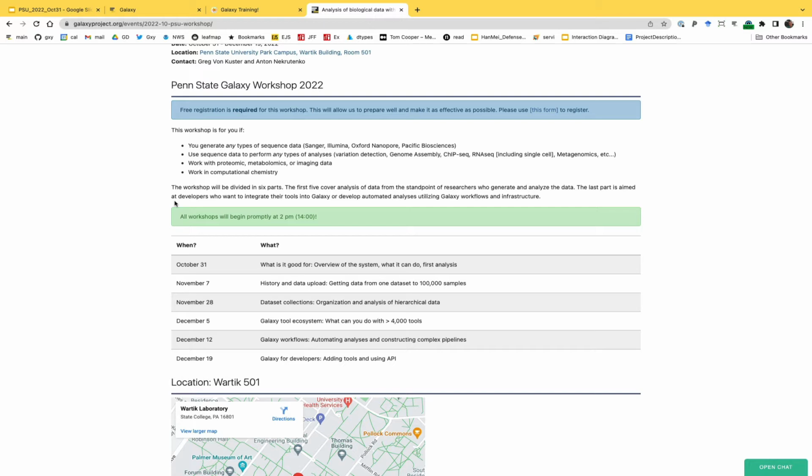So, for example, you're some small country or large country that wants to establish a monkeypox monitoring system, and you collect data, and you just need to analyze it, say, on a daily basis, 100,000 samples today, and so on. So you can just automatically submit these samples and get your results. That's what we're going to talk about on December 19th.